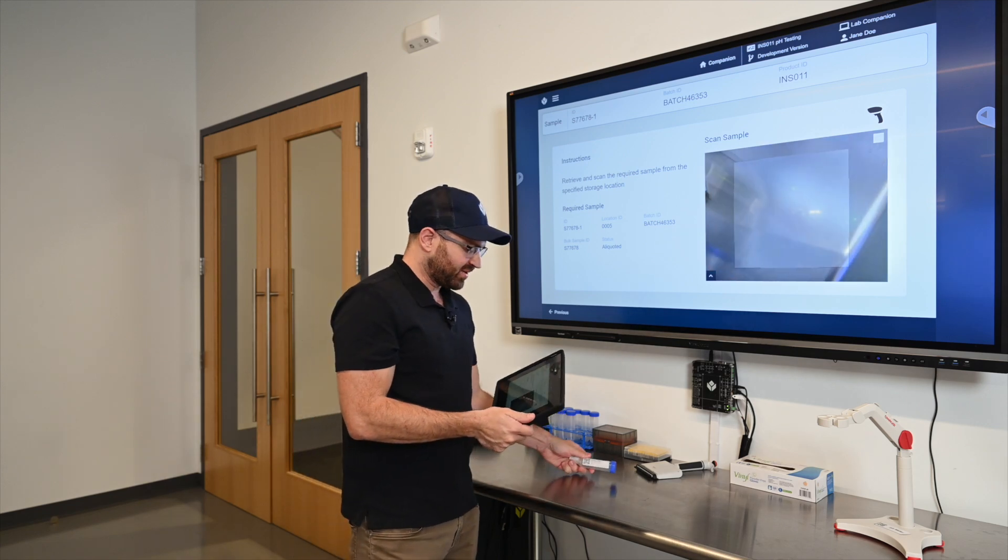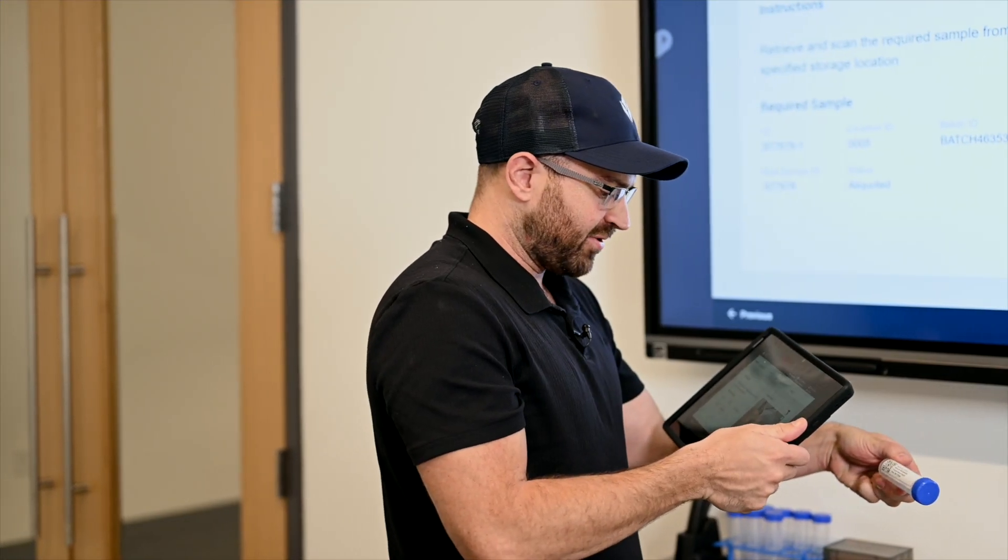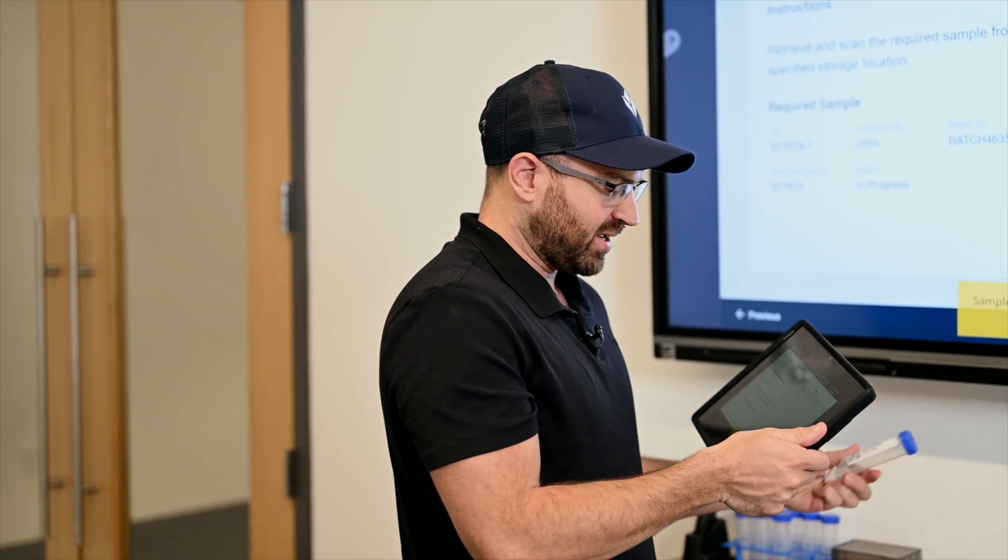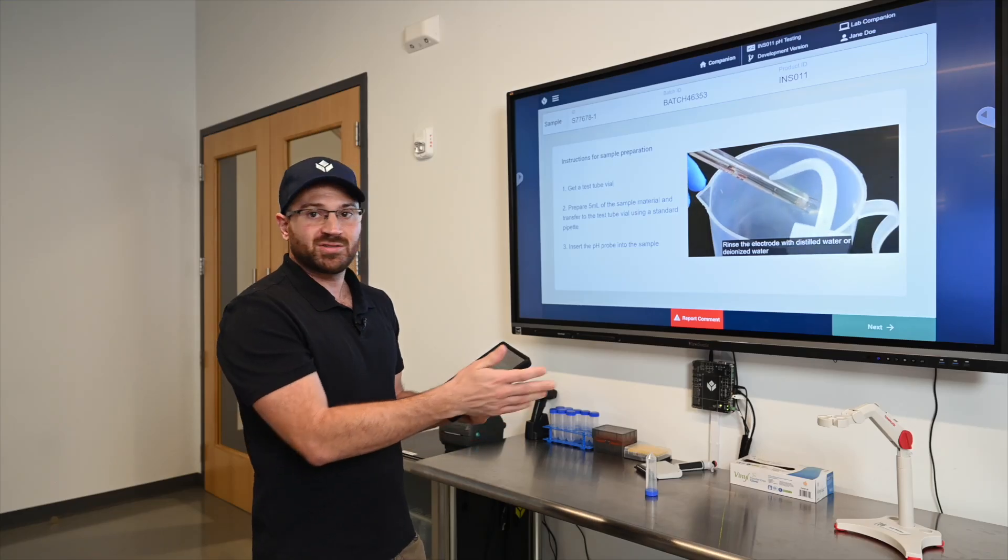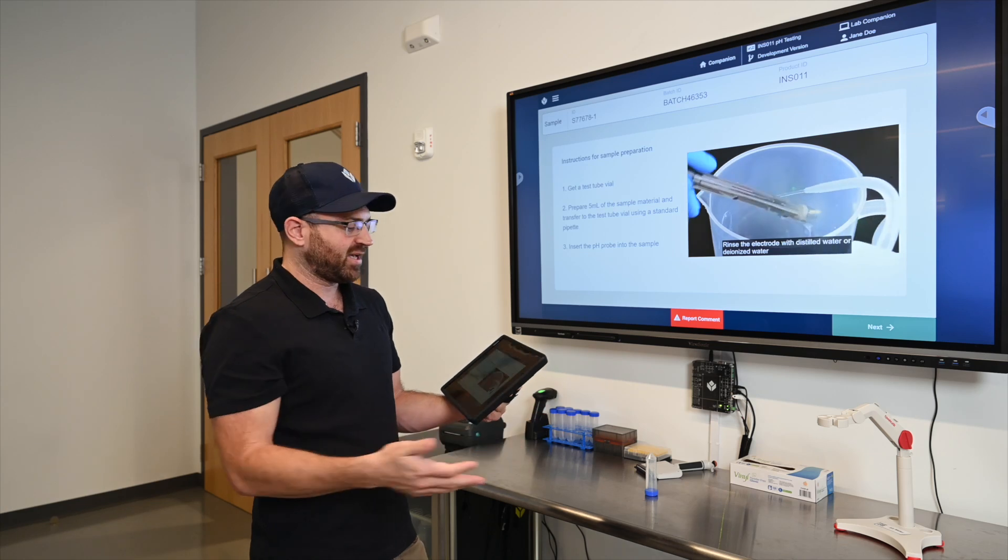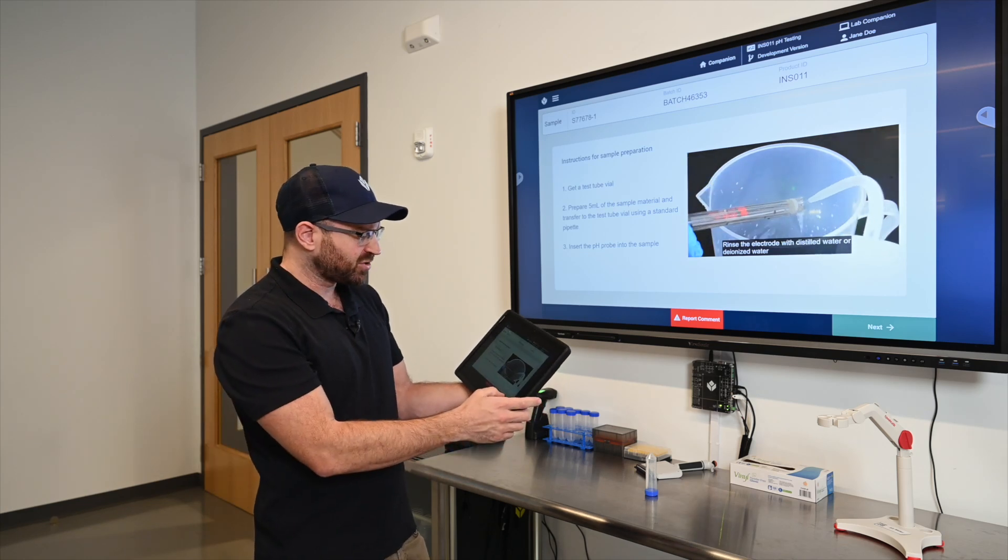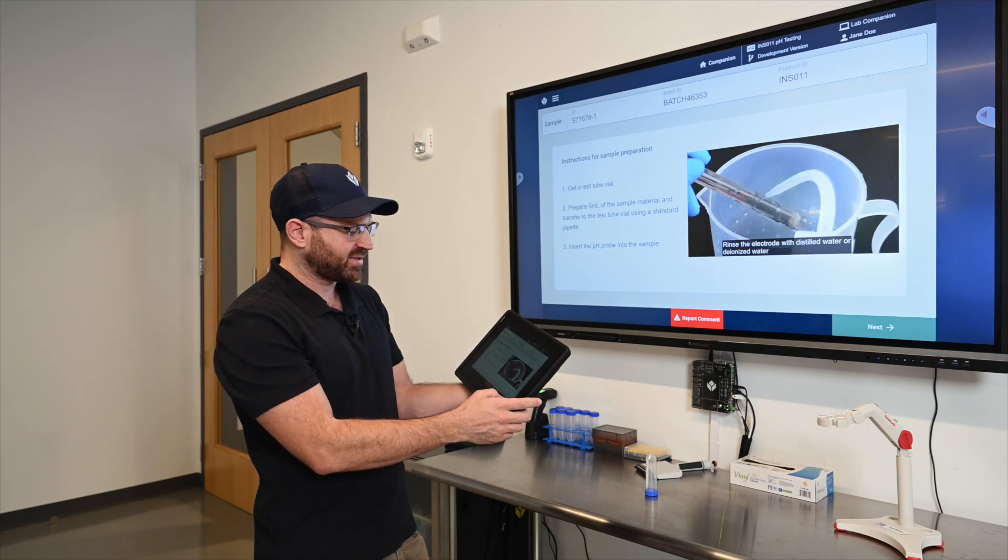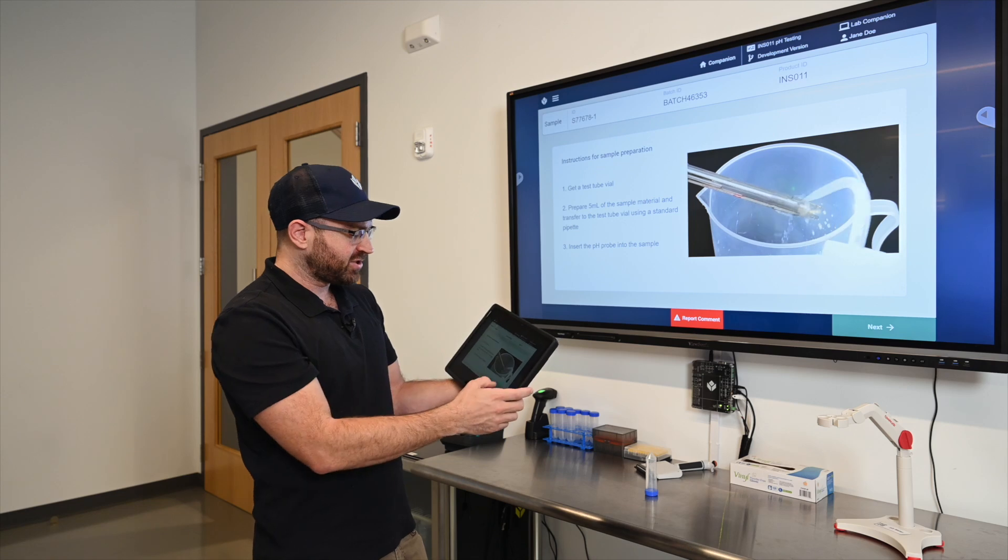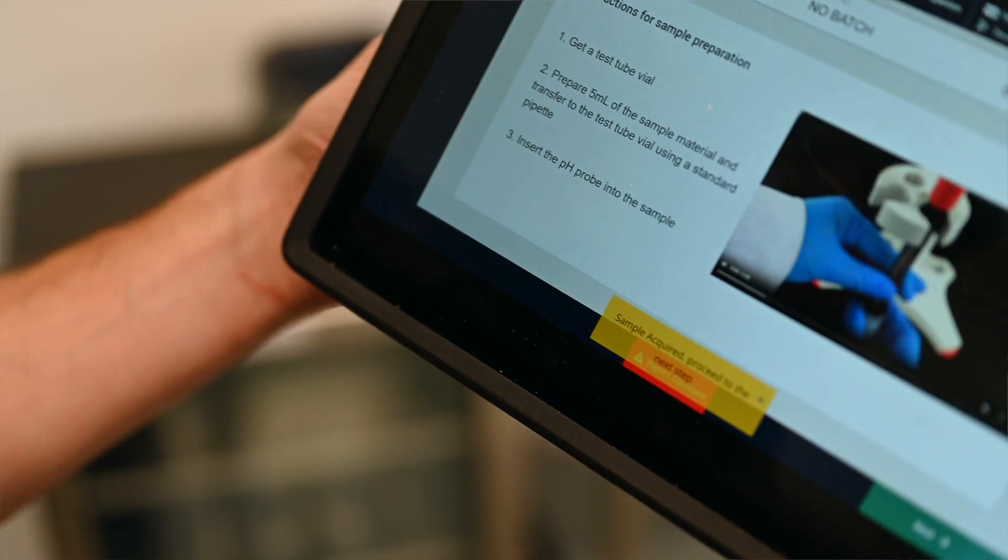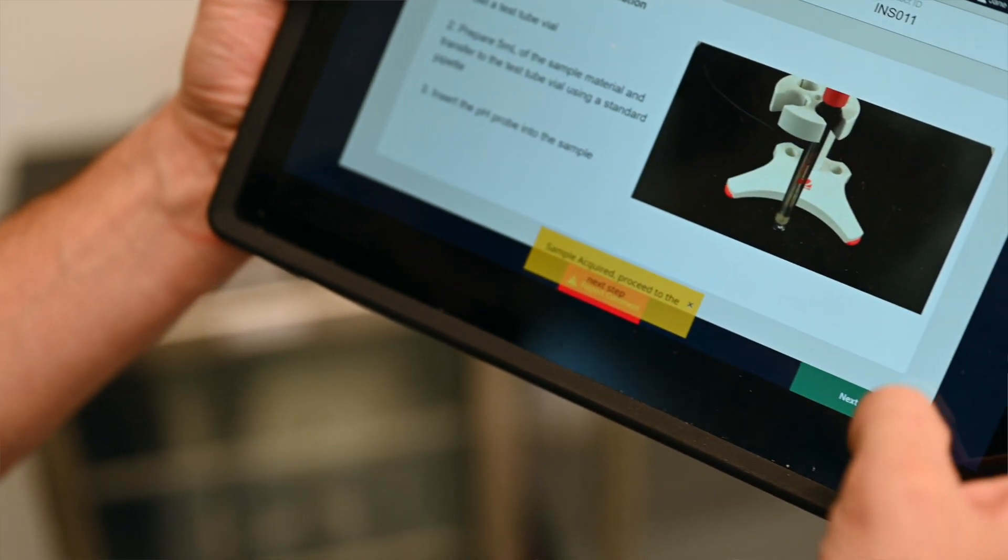I'm going to scan and confirm this is the correct sample that I'm using, and it is, and I can begin my procedure. In this demonstration we're not actually going to connect to the pH meter but you could just as easily connect to this as we have other equipment. I'm just going to show you the lab processes here. We have rich media showing here and I will move to the next step which is to actually record the values from the pH meter.